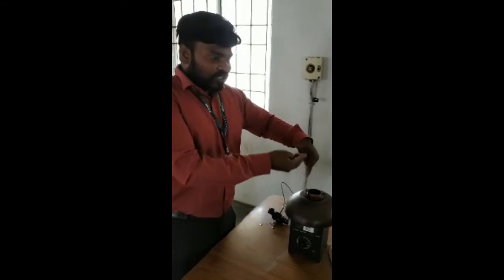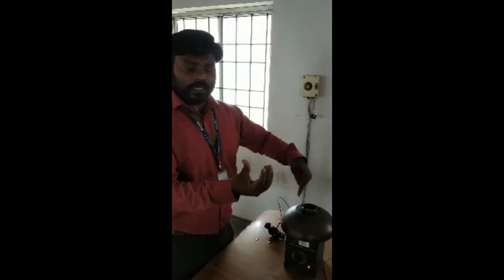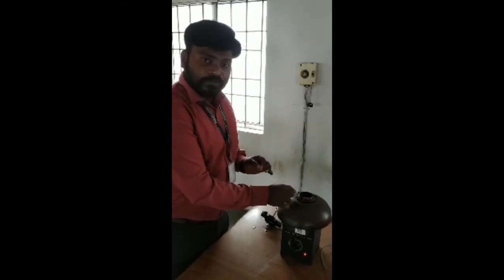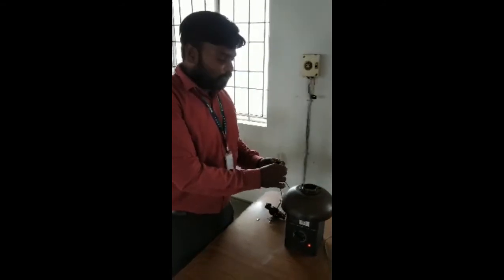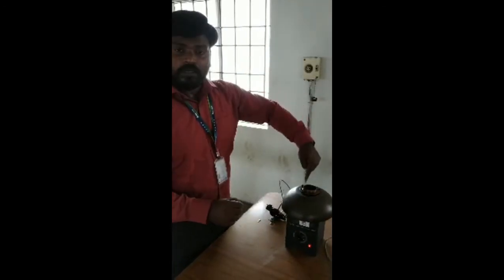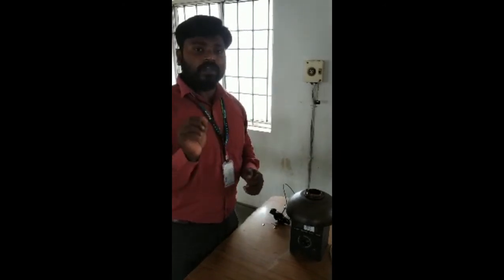When it reaches some 60 or 65 degrees, I am saying this because every fuel has a different range. If you reach 60 or 65, take a matchstick and keep it near the fuel. You have to keep checking every 5, 2, or 3 minutes. Whenever a flash comes from that fuel, you have to note down the temperature reading. That point is nothing but the flash point.